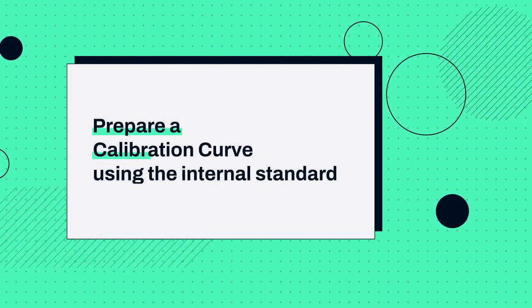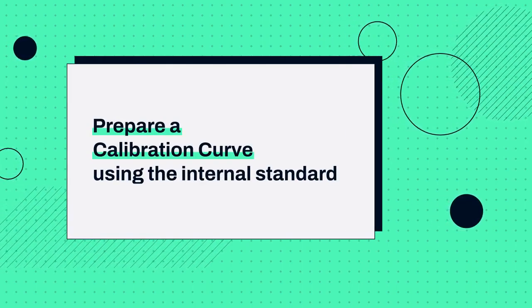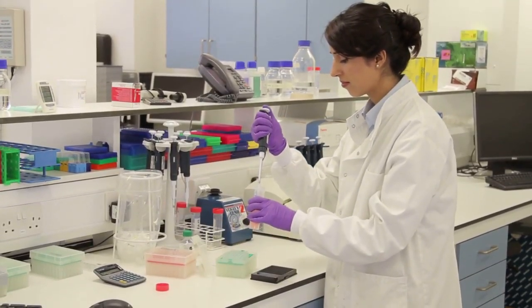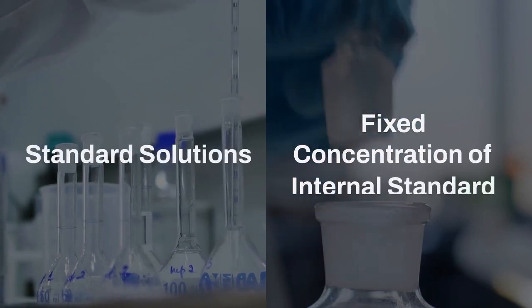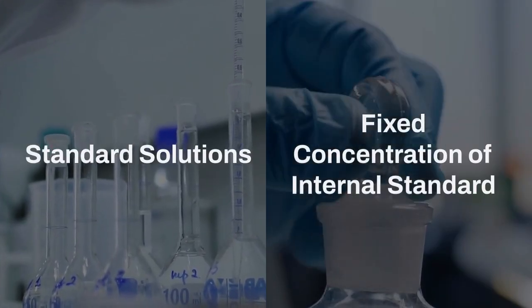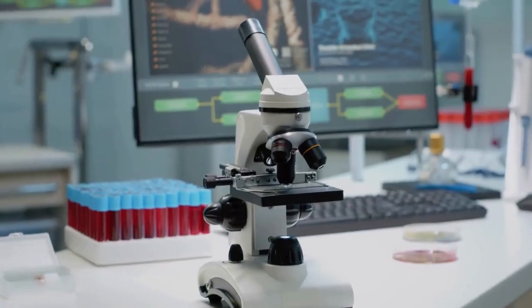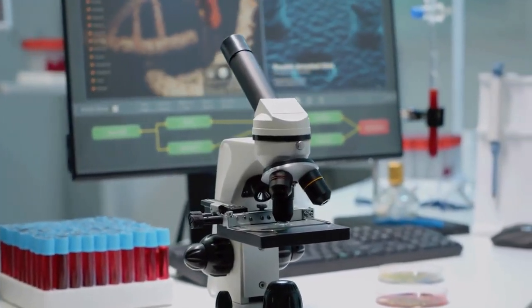The first and most critical step is to prepare a calibration curve using this internal standard. An internal standard is a specific compound that you add in a known, constant amount to all your samples. You'll create a series of standard solutions, each with a known concentration of your desired product and the same fixed concentration of the internal standard. You then run each of these standards on the GC. For each run, you'll measure the peak area for your product and the peak area for the internal standard.